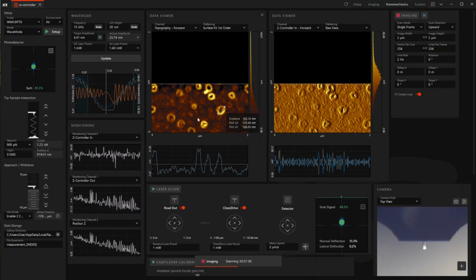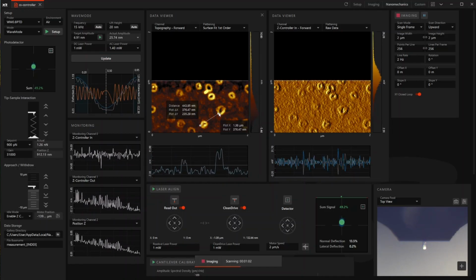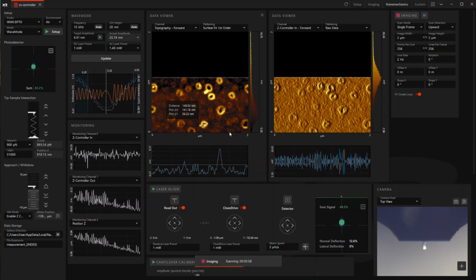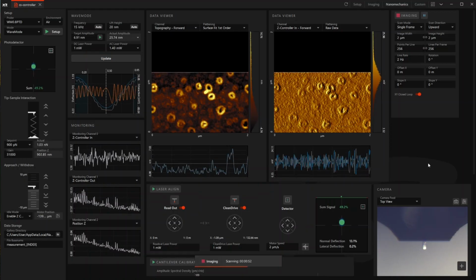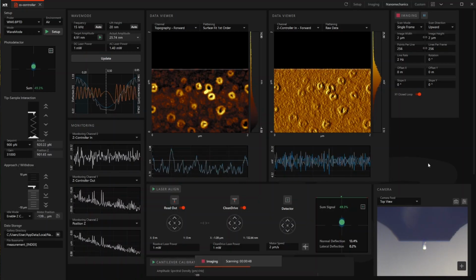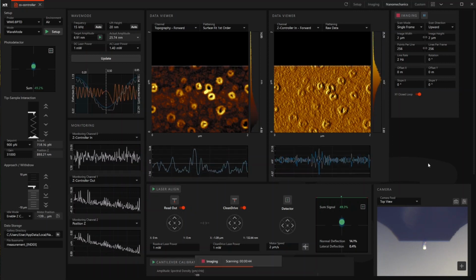Out of curiosity, I measure the size of these craters, and yeah, it's about 180, maybe 200 nanometers, or even smaller. I can anticipate to you now that this is quite interesting because in other classes we will see craters of different sizes.